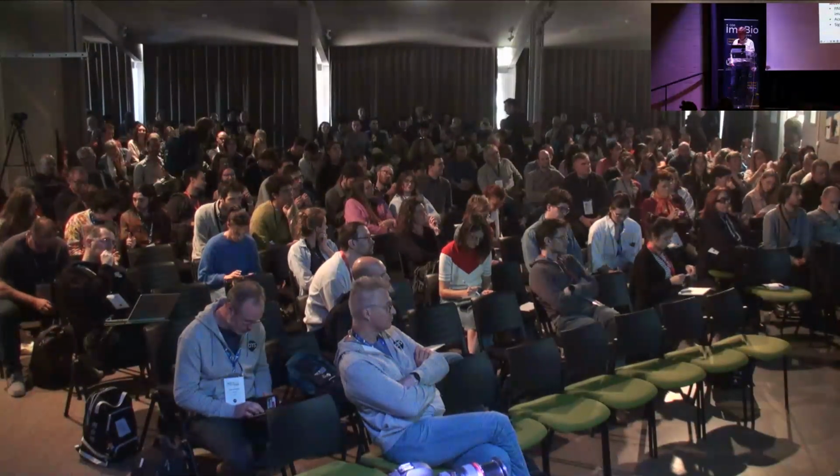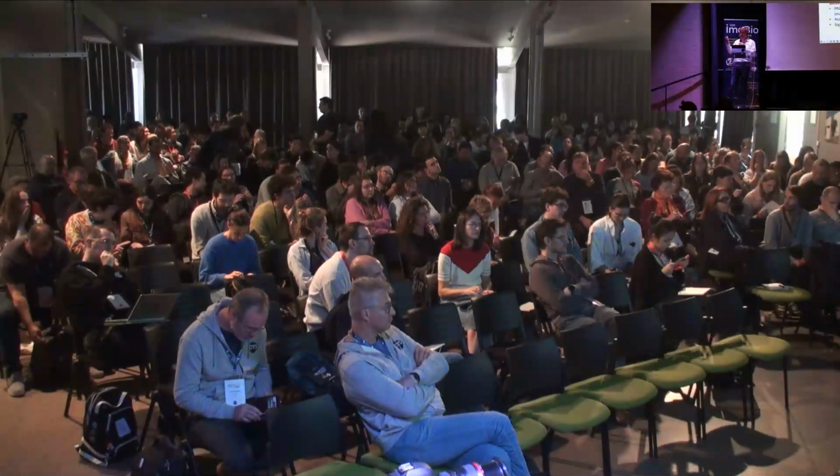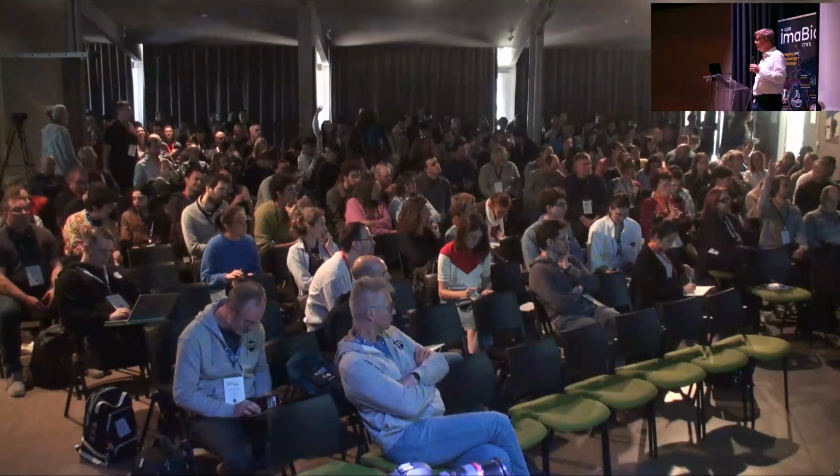So the acquisition time is similar? It would take, I would say, typically in the tens of minutes to an hour range. Thank you. Are there any other questions?